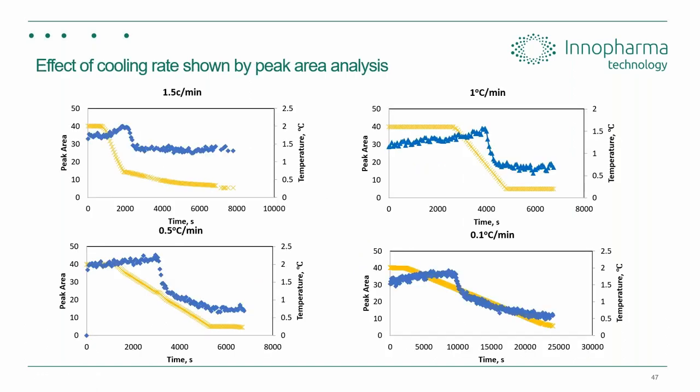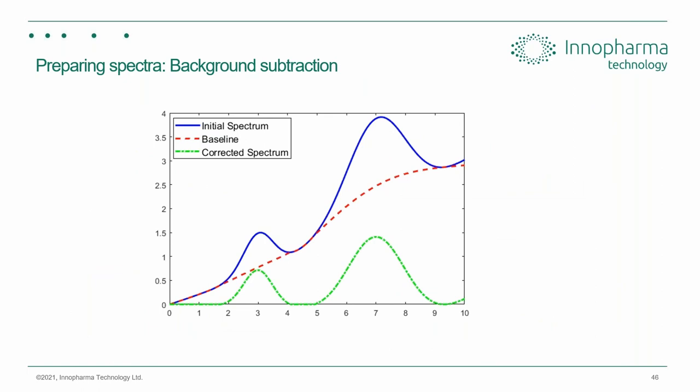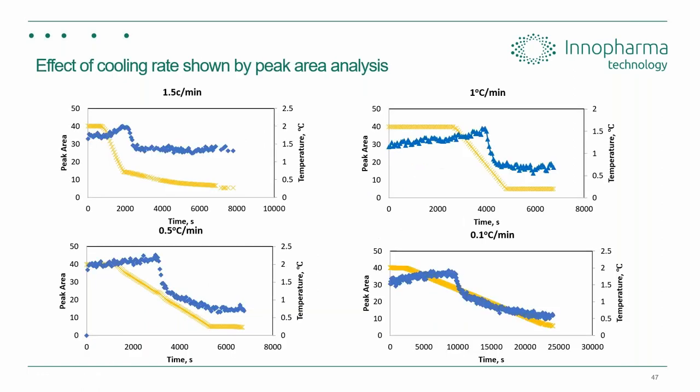Oh, in fact, let's just discuss what that gives us. Once we have these corrected spectra, we can use that raw, or almost raw data in the case of one type of model development that we use here today. We can already use that near raw data just after the background is removed to do peak area analysis. As I mentioned earlier, peak area correlates very strongly to the concentration present. Peak height does as well, but peak area is a little bit more robust after background is subtracted. And I'll discuss that in just a moment.